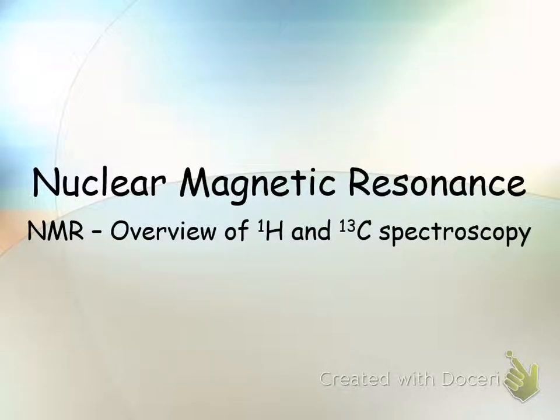Trying to explain to students what NMR is, okay? So first of all, let's think about electrons, okay? Where are the electrons? Not in the nucleus, right? They're around the nucleus, but you guys know about some of the properties of nuclei that might be helpful in understanding NMR.